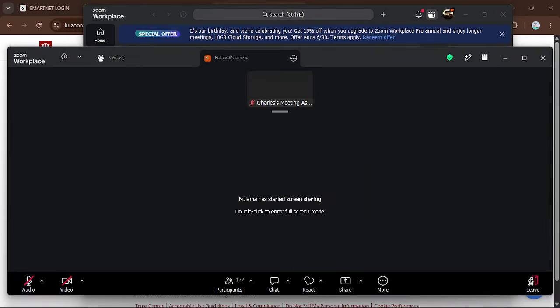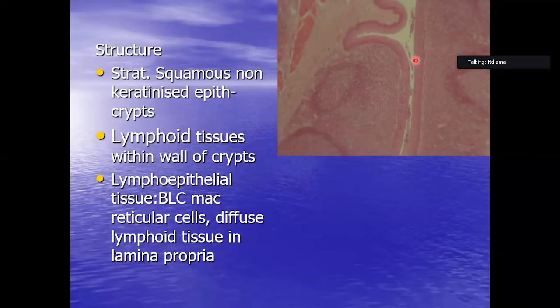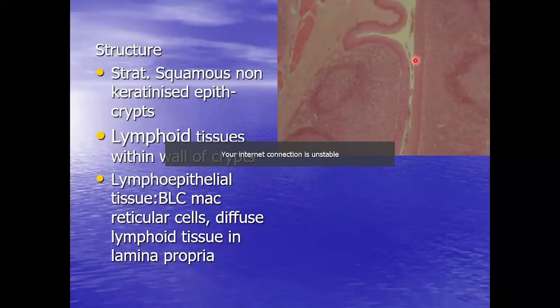Incomplete capsule. A lot of branches. The palatine tonsil is the one normally prone to this, because of exposure and stimulation of the lymph tissue.